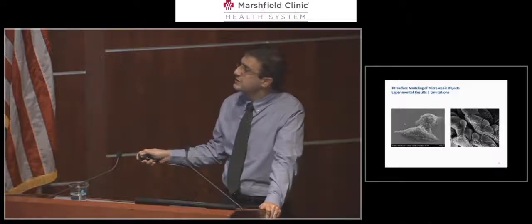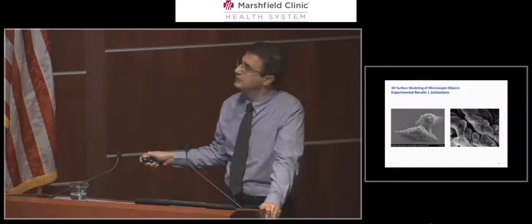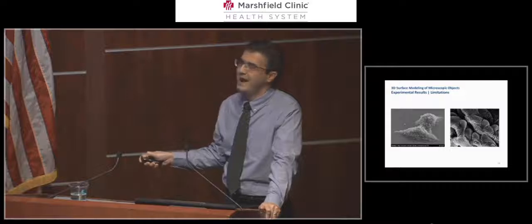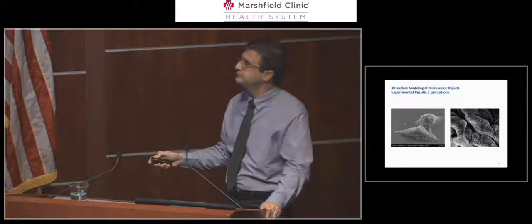The other limitation is that when we have complex surfaces, using this algorithm we are not able to find the accurate 3D model of the microscopic object.